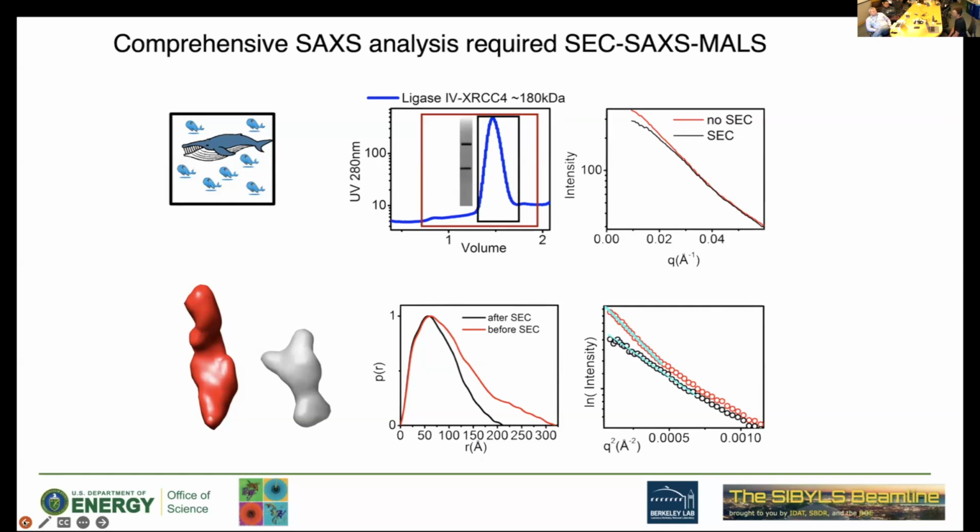Here in this case, we can probably also separate the signal for this little bump here, that's aggregates. But yeah, you can study that and just see the signal for the aggregates. That's definitely potentially possible. Normally what I'm showing here is just how to define and predict structures from the size exclusion coupled SEC-SAXS. Yeah, I guess you're getting at the nanoscale and mechanism and everything, but there may be this mesoscale assembly that's worth keeping an eye on, since SAXS actually speaks to both, I guess.